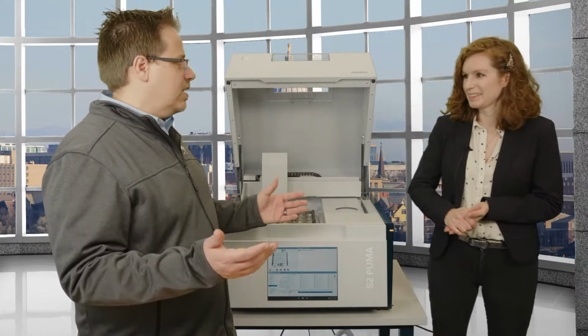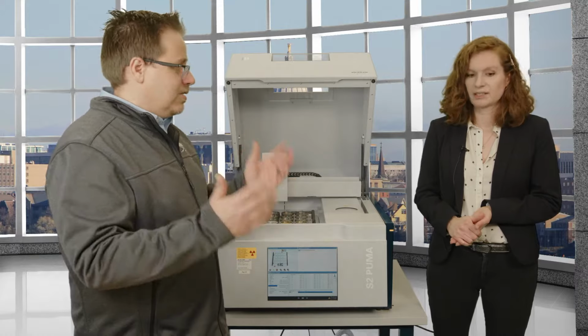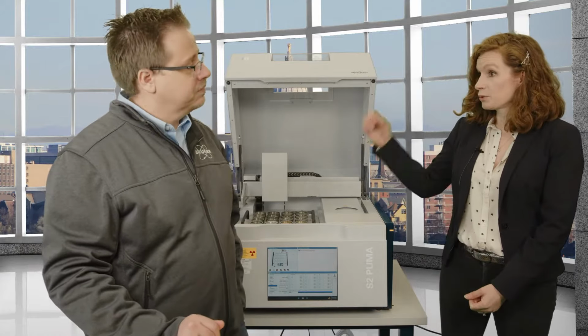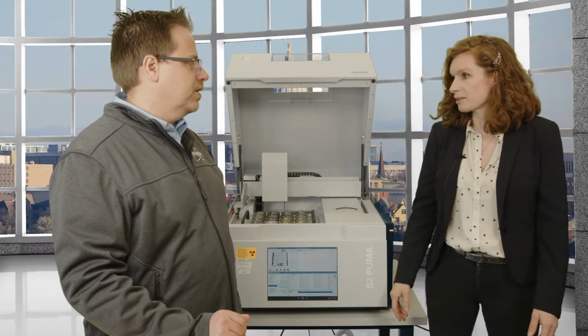All right. So there's always that case, right? With any analytical technique, there's the best case scenario, best prepared sample, and then there's the deviation. So it sounds like it can be pretty darn precise if everything is right. And the thing is, in the same sample, you can go to 100% iron with a few ppm of chromium or something like that, right?